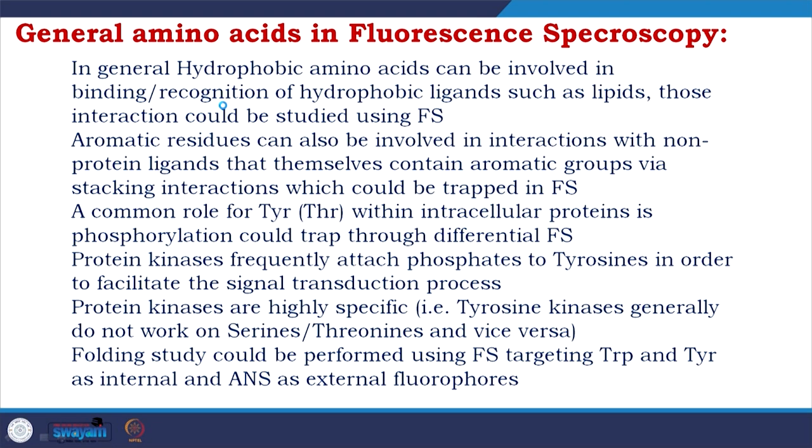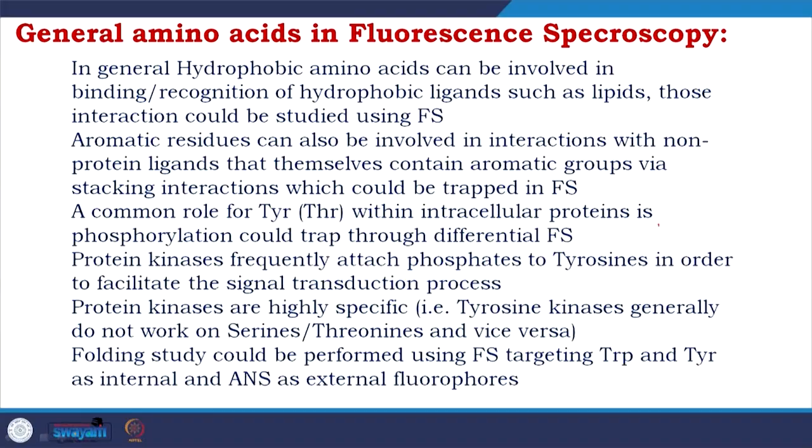Folding studies could be performed using fluorescence spectroscopy targeting tryptophan mainly, but also tyrosine as internal and ANS as an external fluorophore. I talked about what happens whenever you provide energy like thermal energy to the protein. The soluble protein will start opening up, right? So, you have a folded state and you get unfolding, right? Not interesting, but sometimes it could be very interesting when you have the folded one, you put heat, it opens up, right? Instead of opening up completely, it opens up with some hydrophobic clusters being retained. That is called the molten globule state.